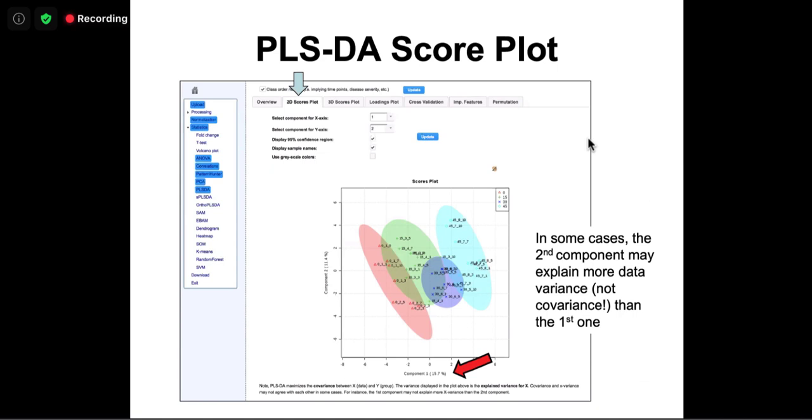There is a question in the chat about PCA. Question regarding the PCA scores plot: I have seen some people apply a t-test or ANOVA to the principal component scores assigned, i.e. PC1, to each sample from different groups to identify if a separation that is visible on the scores plot is statistically significant along a principal component. What are your thoughts? This is from Juan.